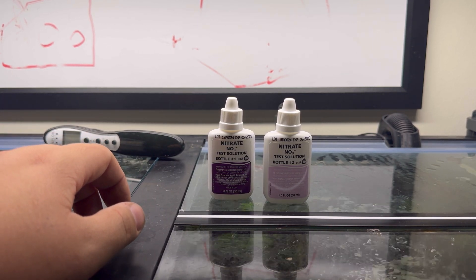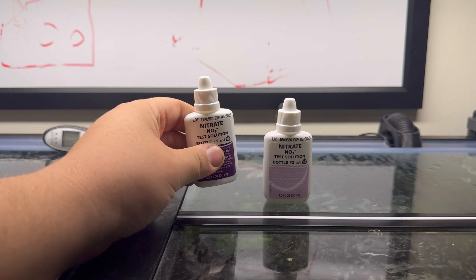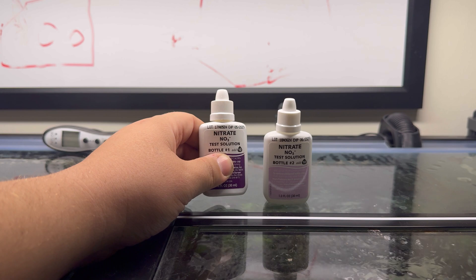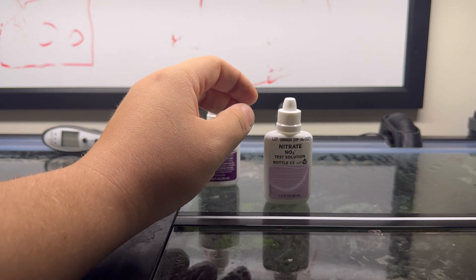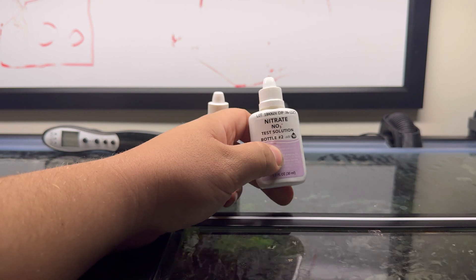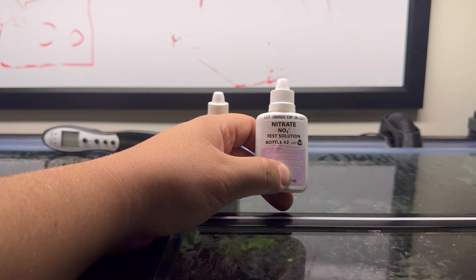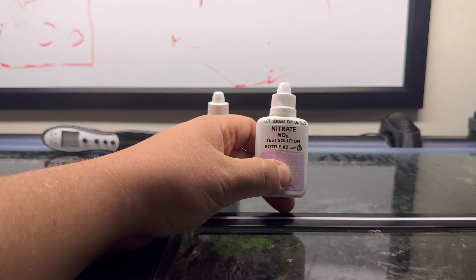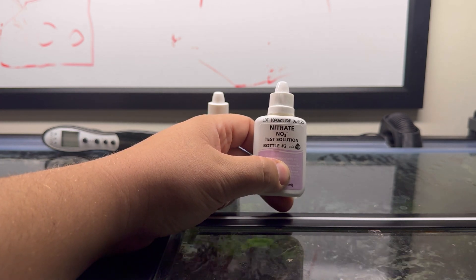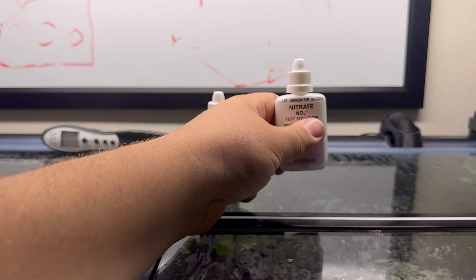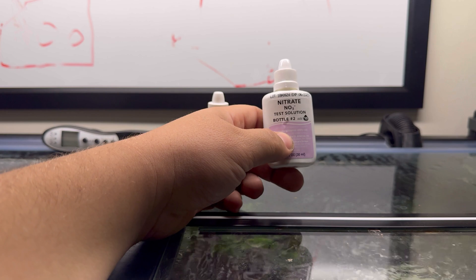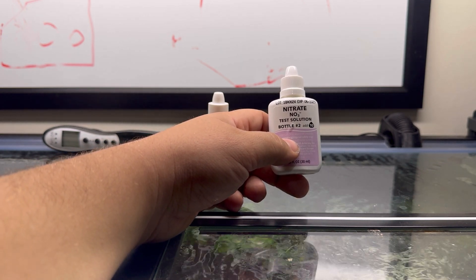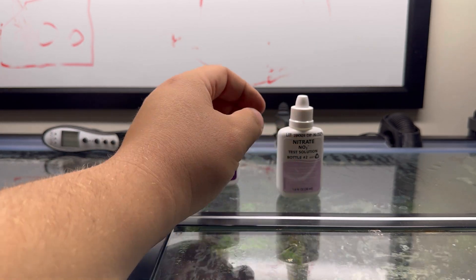The simple process is you add your 10 drops to your vial of five milliliters, cap and then shake to completely mix the first solution. After you cap and shake, the very important step—do not skip this step—is to vigorously shake solution number two, bottle two, for 30 seconds in order to aerate it. It's very important to shake it for 30 seconds. That's pointed out clearly in the instructions.